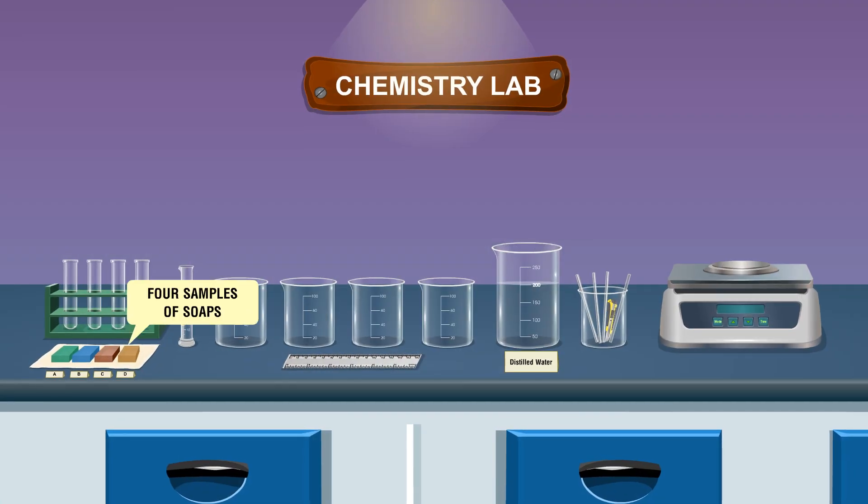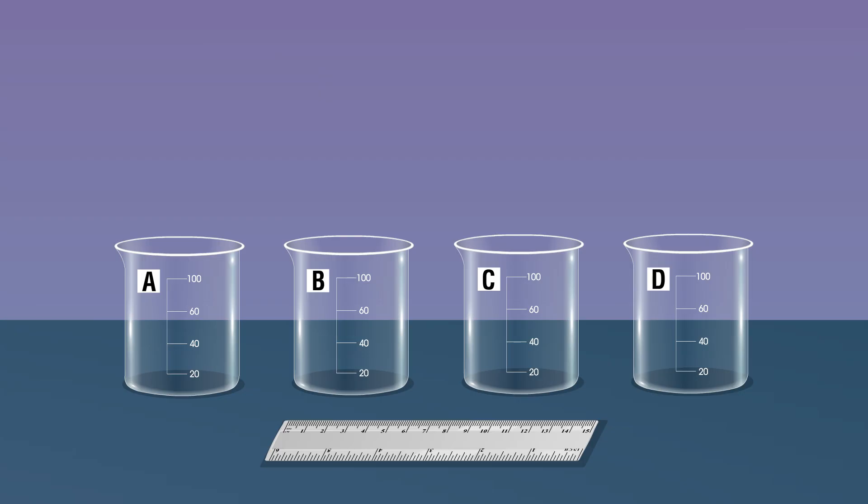For different samples of soaps, distilled water, electronic balance, four test tubes, four beakers 100 ml, four glass rods, a measuring cylinder, and a measuring scale 15 centimeters and a cutter knife. Take four labeled 100 ml beakers.